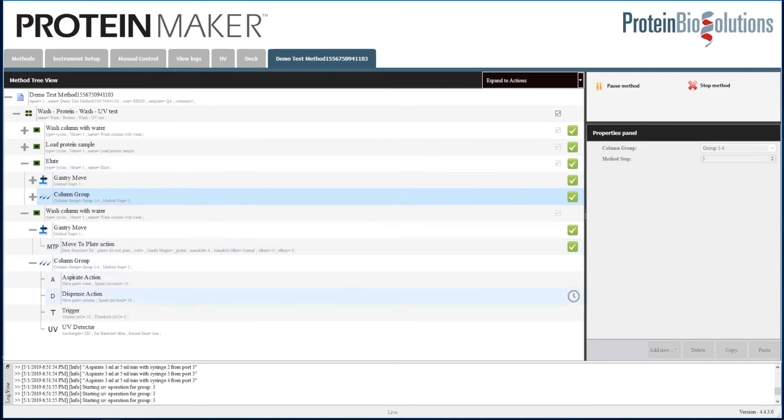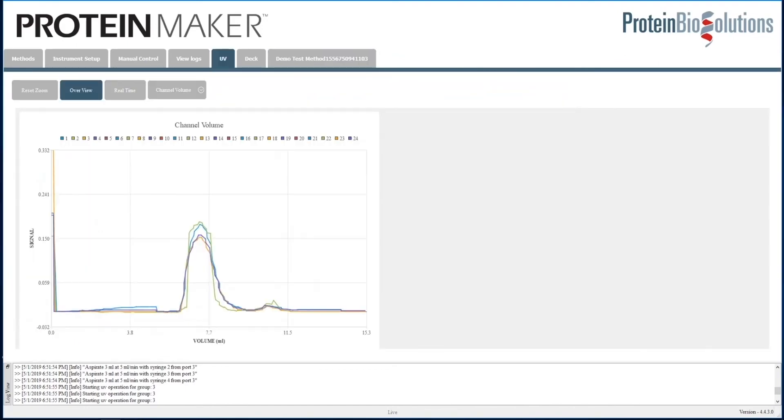In the method, the green check marks along the right side track progress and show which steps have been completed. Looking at the UV tab again, we can cycle through different views.